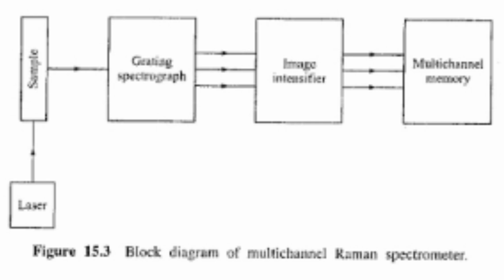Here is the block diagram of the multi-channel setup, which reads and writes the data simultaneously, and it transfers the data efficiently. And the multi-channel memory has a large bandwidth, which stores a wide range of data. The information or data can be stored on magnetic tape or computer memory.